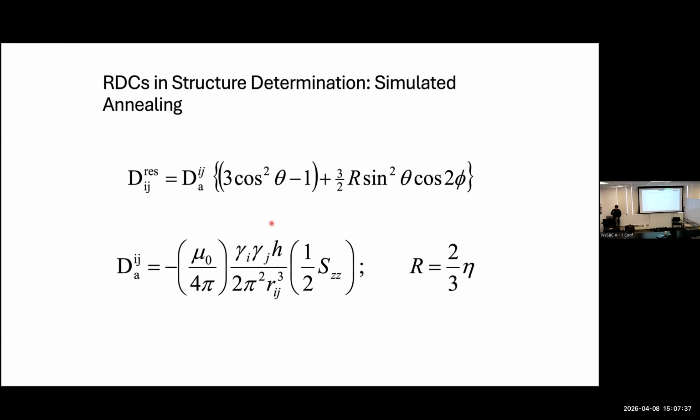Now the weakness is you can't tell the time scale. You can't determine the time scale of the average. But the measurement will be averaged over all the configurations over sub-millisecond time scale. So that makes it very sensitive.